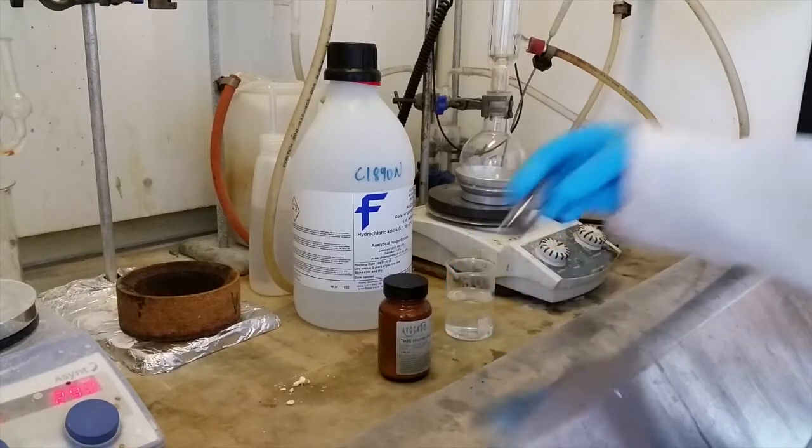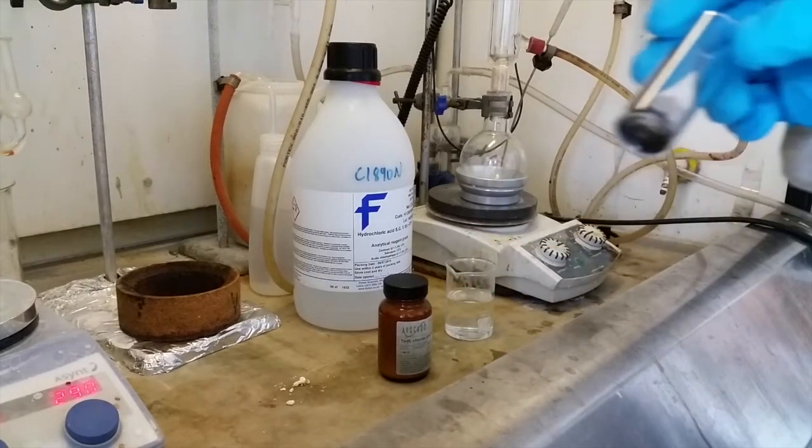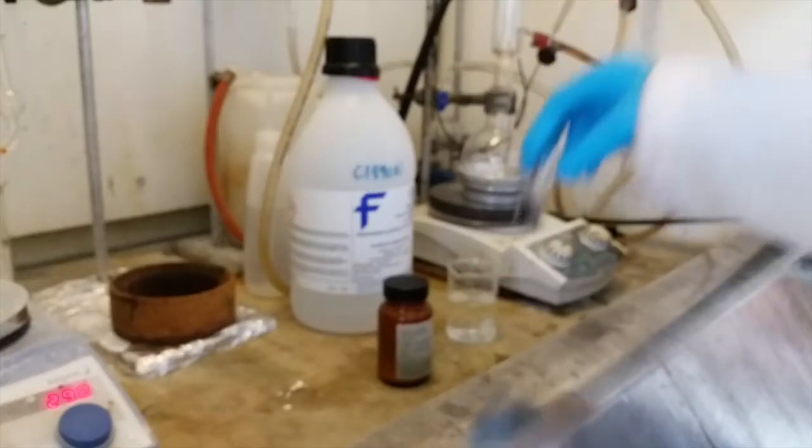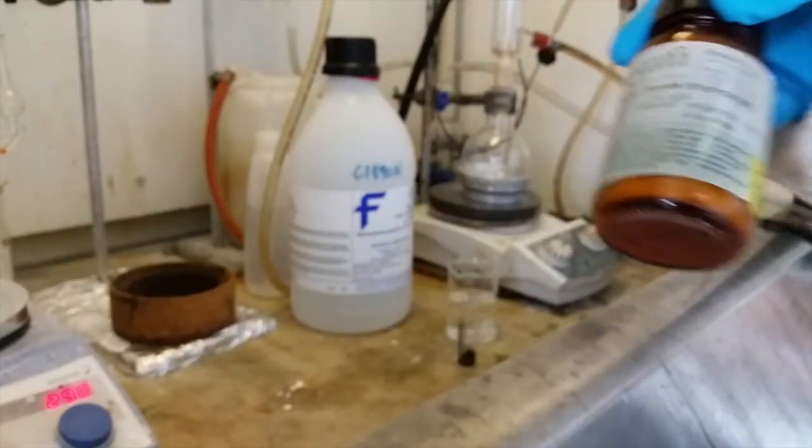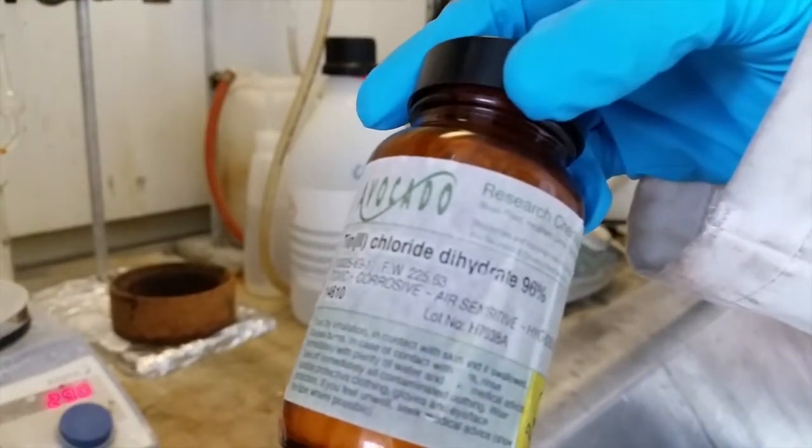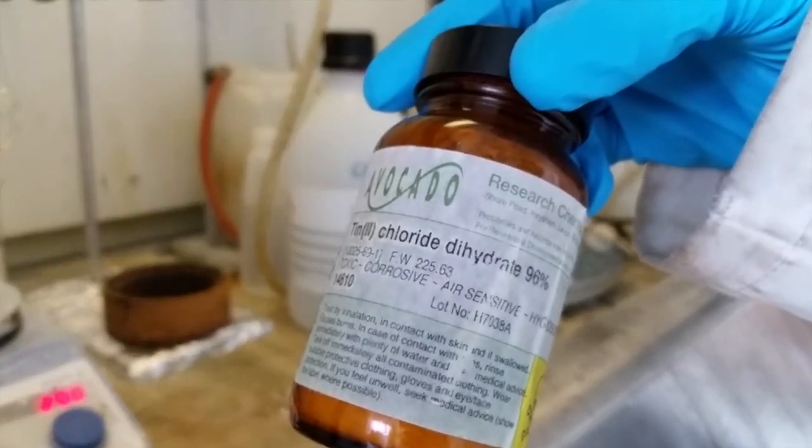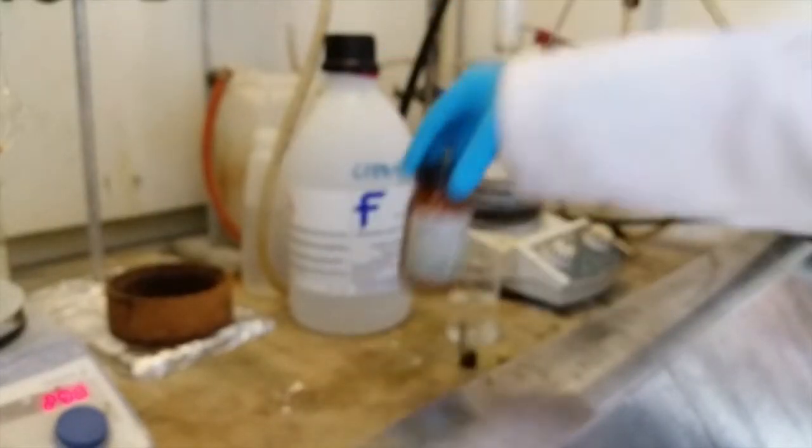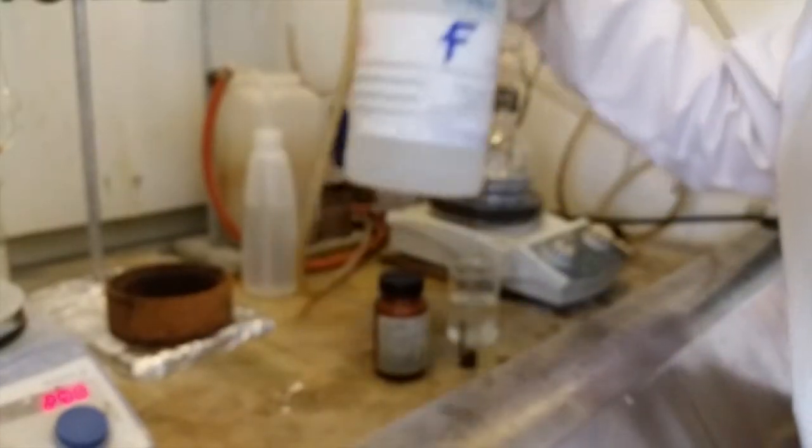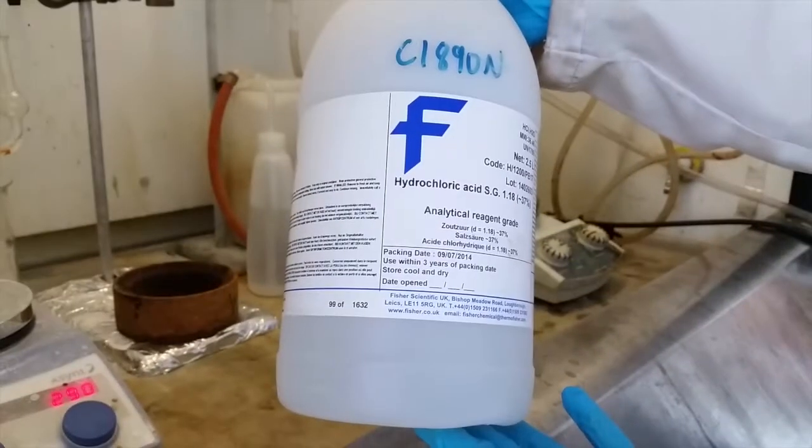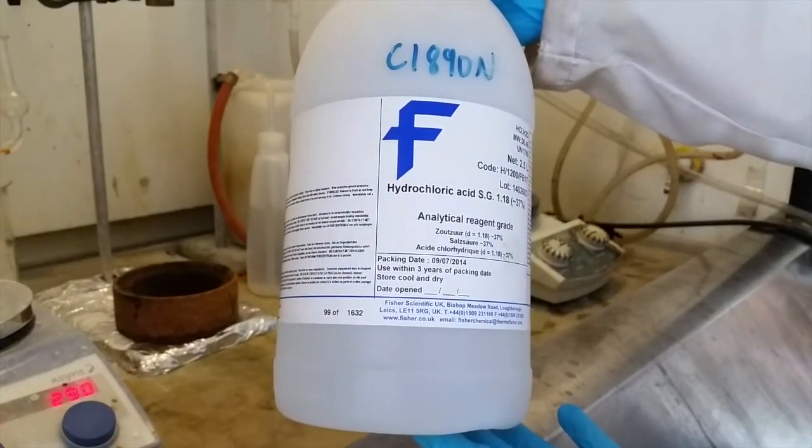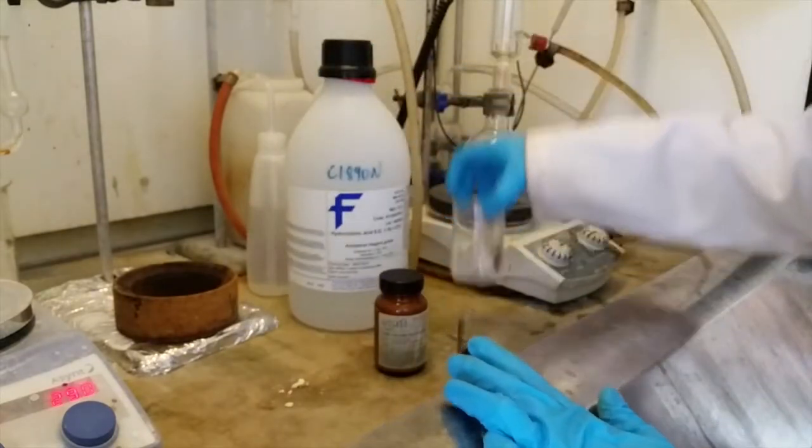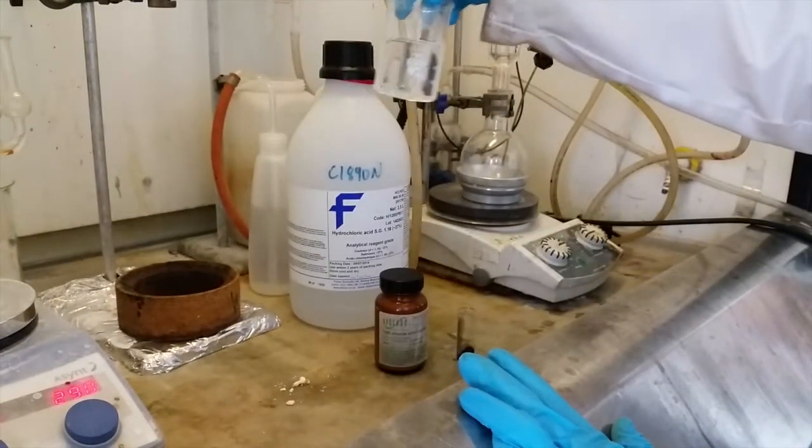In order to do this reaction you will need the nitrated TPP-NO2 porphyrin which you made last time. You will also need some tin 2-chloride dihydrate and finally you will need some 12-molar HCl. This reaction requires 6-molar HCl so you will also need some water in order to dilute this HCl.